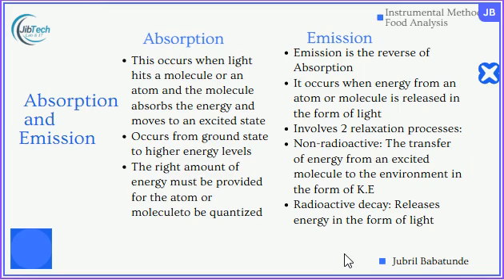We're going to deal fully with two of those instruments, the UV visible spectrophotometer and the atomic absorption spectrophotometer.